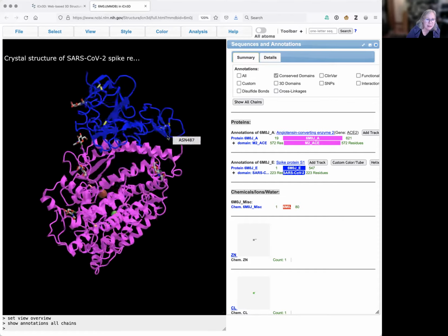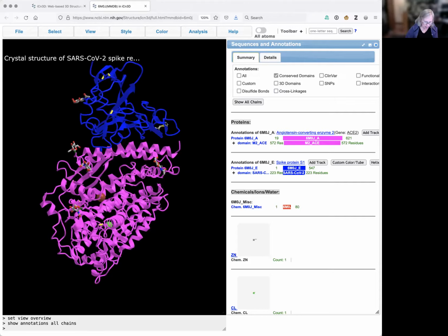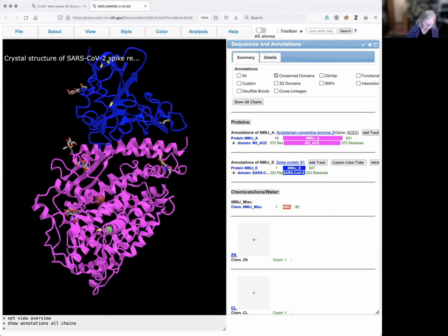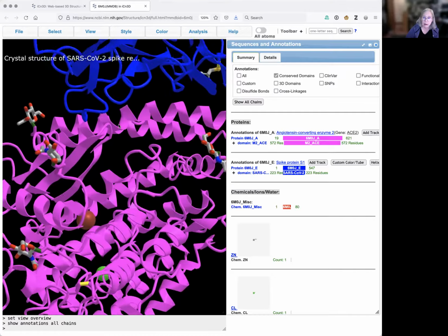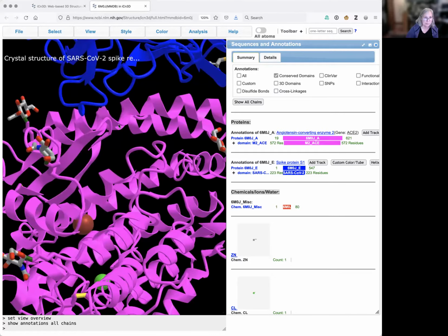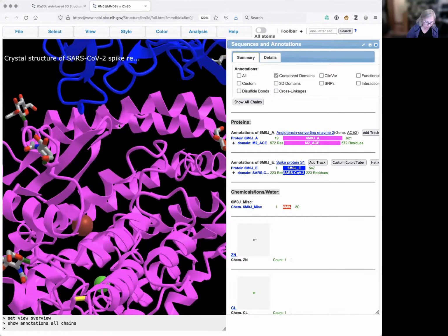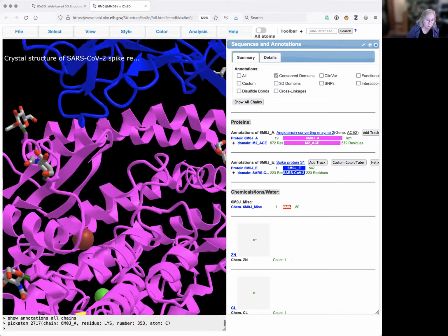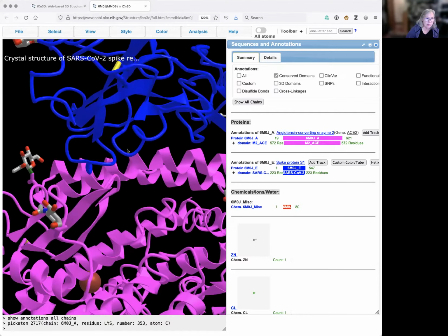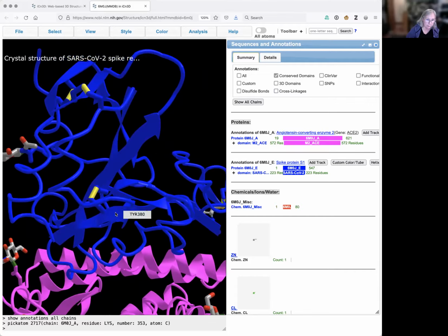Okay, to look at any one of these, we need to zoom in. I'm going to do this using the Z key on my keyboard, but I could also just drag on my touchpad, drag my fingers away from the monitor. And then I hold the Control key down so I can drag the structure and reposition it.